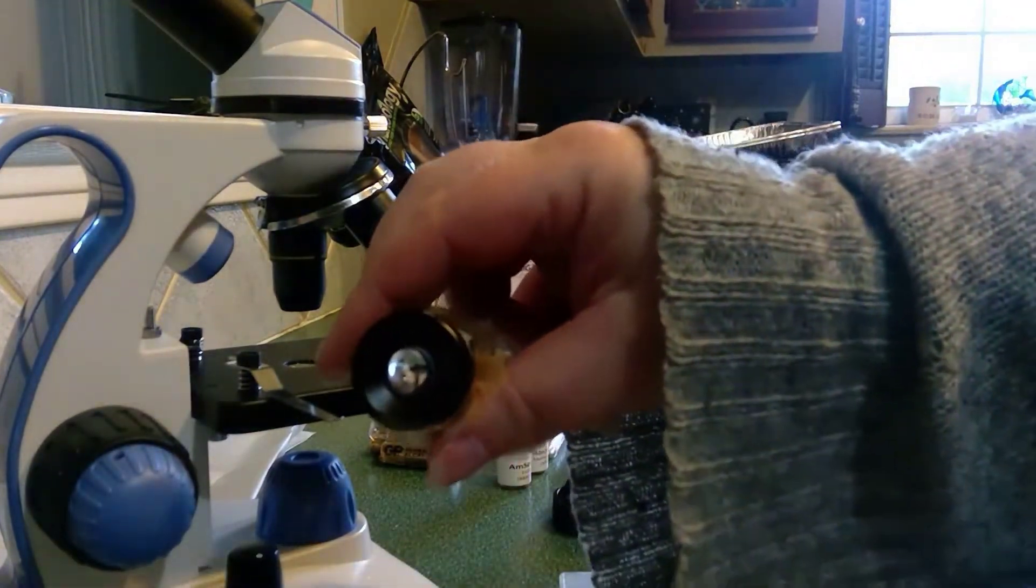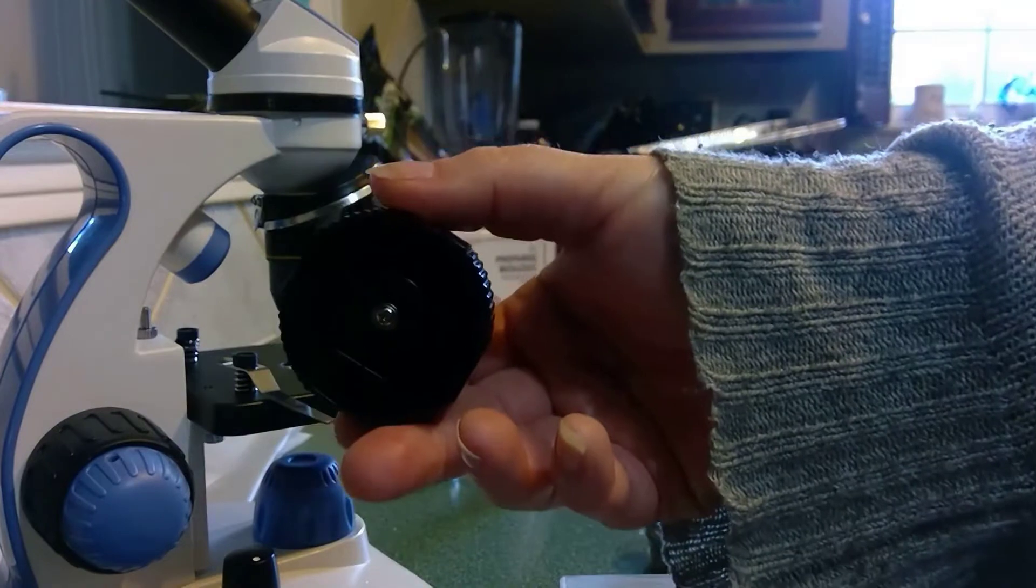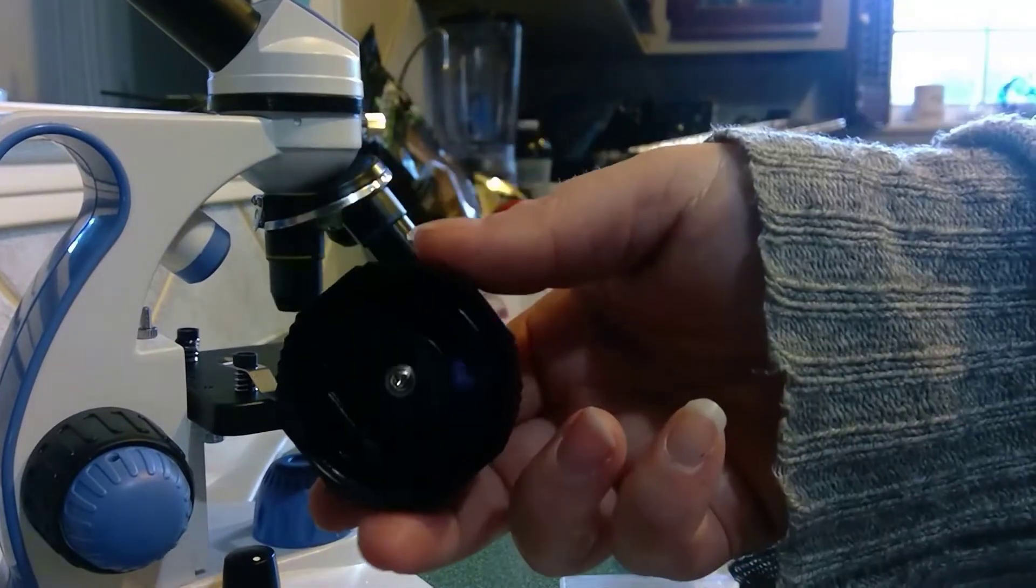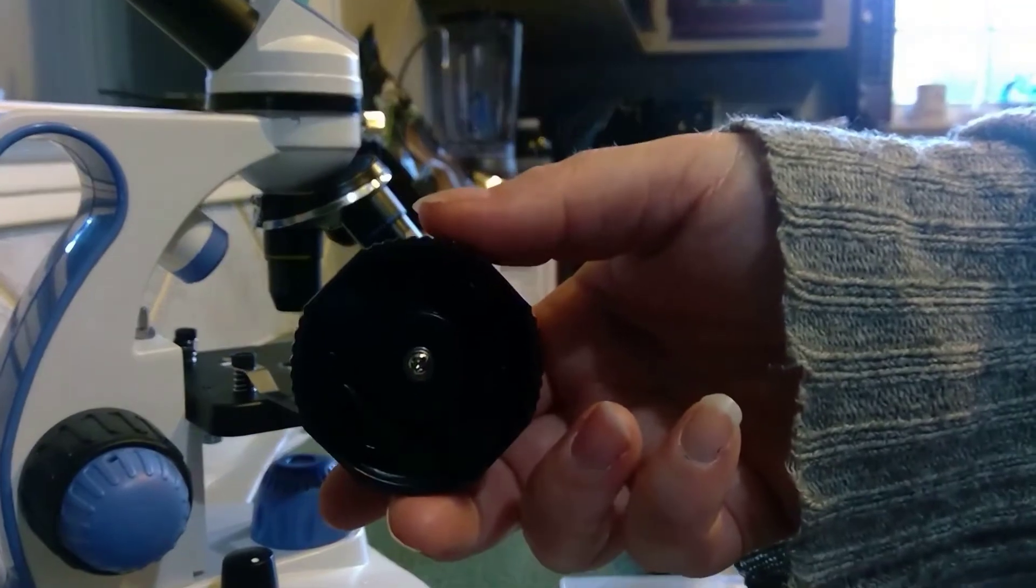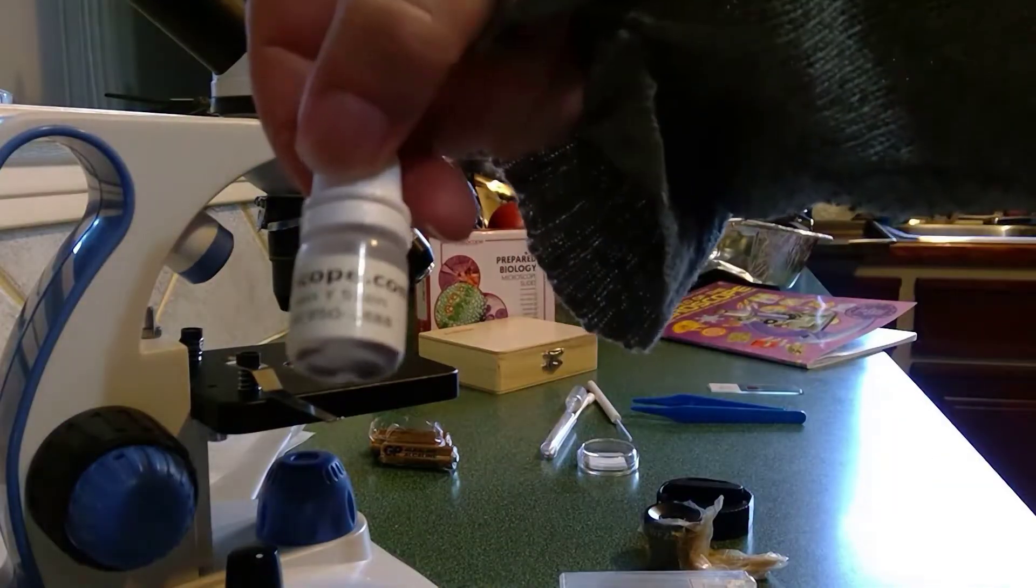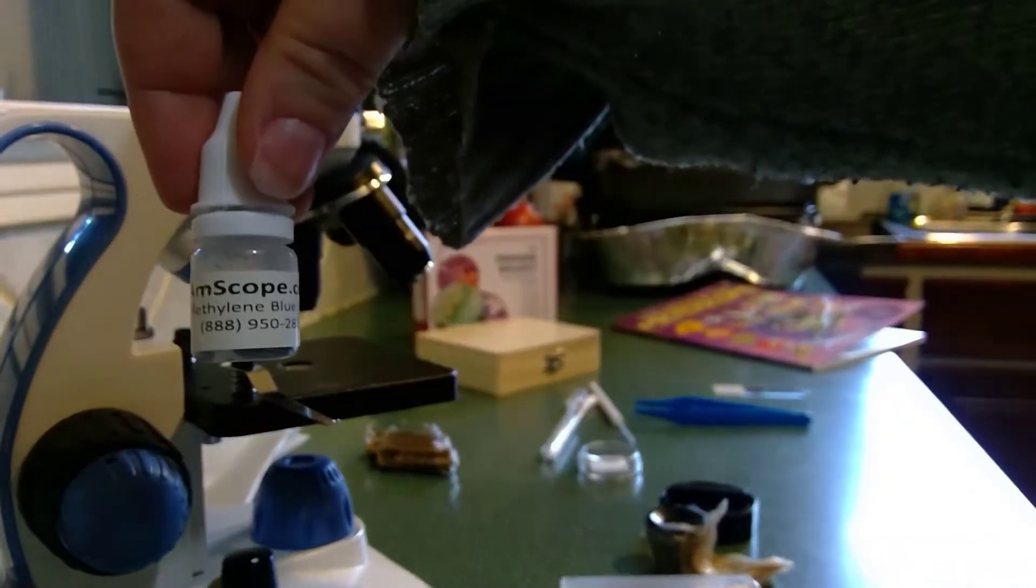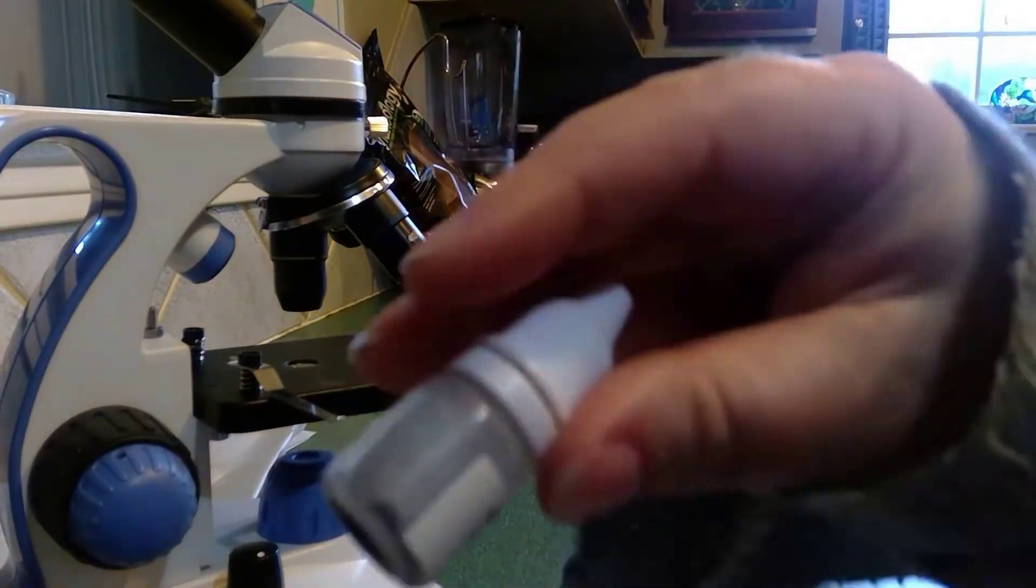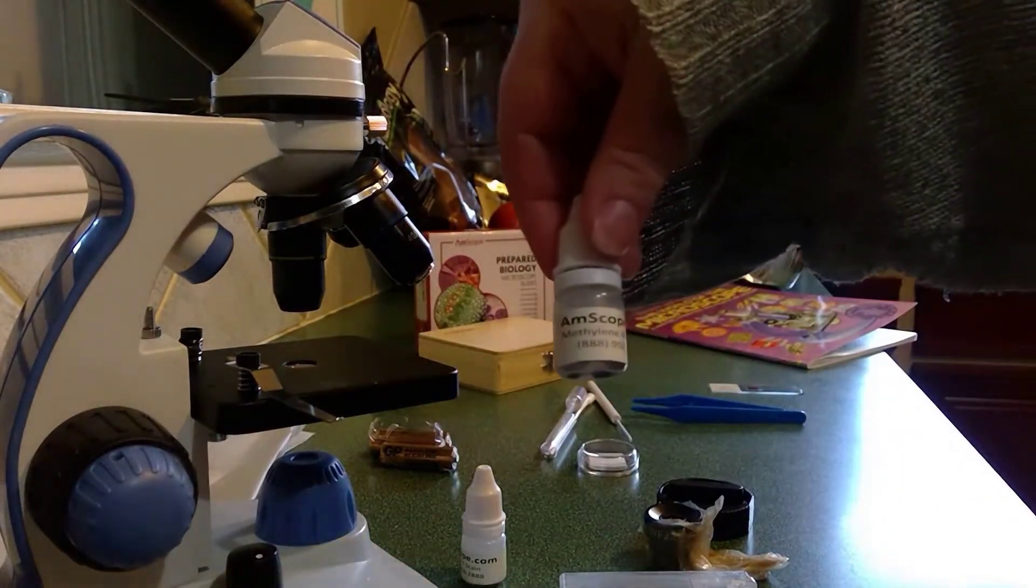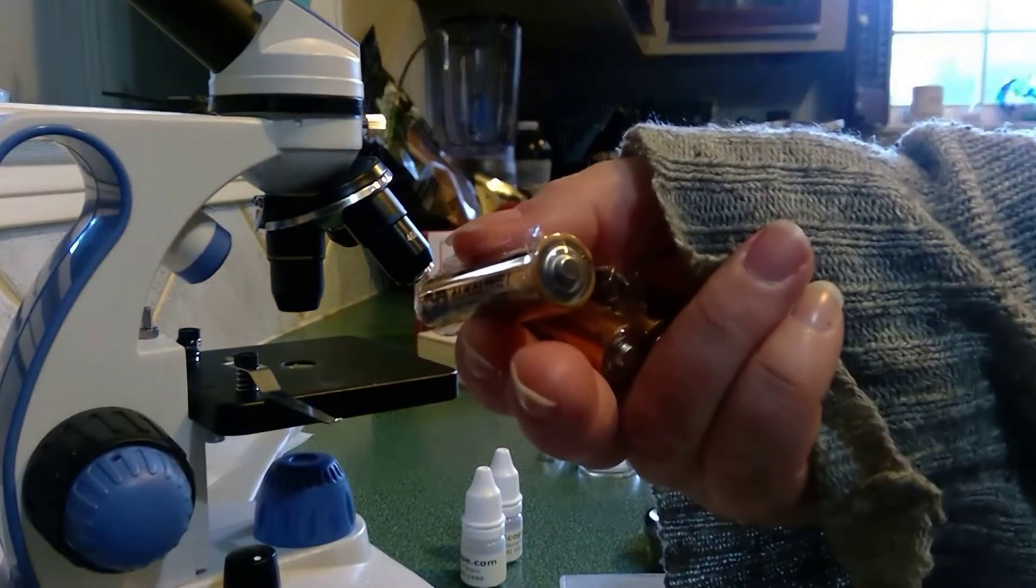It comes with another lens. It also comes with a microtone, which I had to look up to find out what this does. But I guess what this is for is the things that you're looking at in the slide, like plant parts, they need to be really thin in order to see them. And this helps you slice those pieces into very thin layers so that you can look at them through the microscope. It comes with two stains. One is the eosin stain, and this is the methylene blue stain. So it comes with the stains, but they are in powder form. So I'll have to find out how much liquid to add to those in order to get them so that we can use them. Again, it comes with batteries so that you can unplug it and take it outside with you.